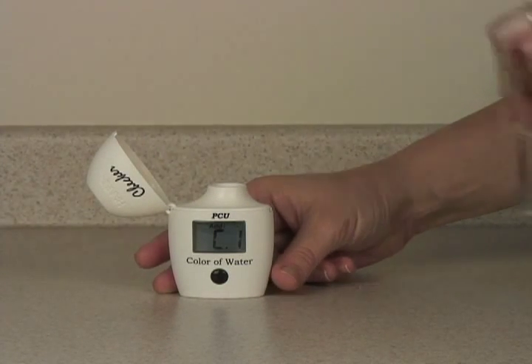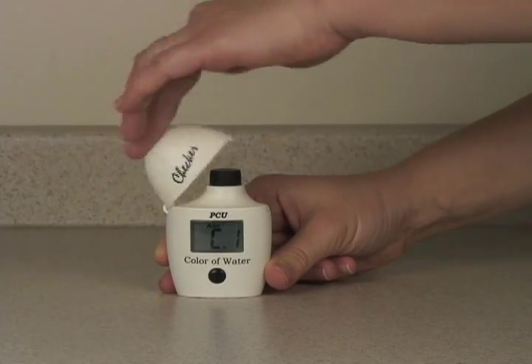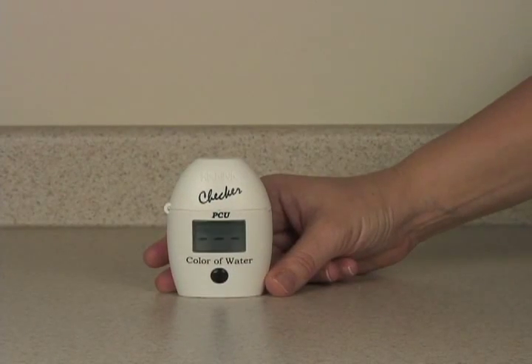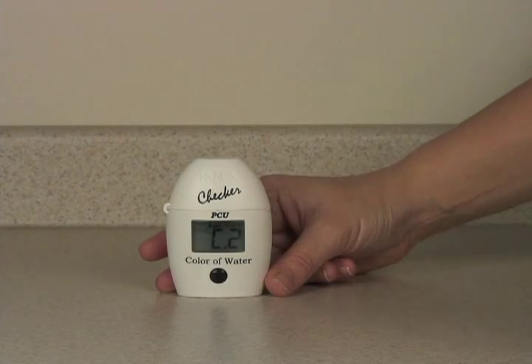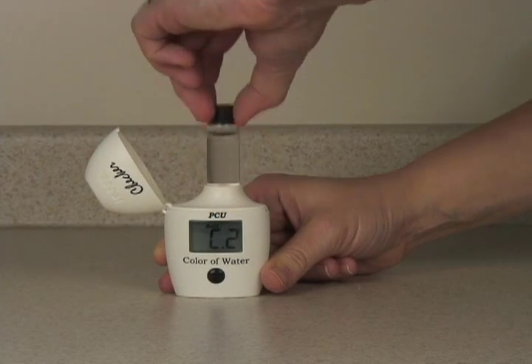Now you want to zero it again. Take your same blank, put it back in the meter, and press the button once to zero it. When the meter says C2, remove the blank.